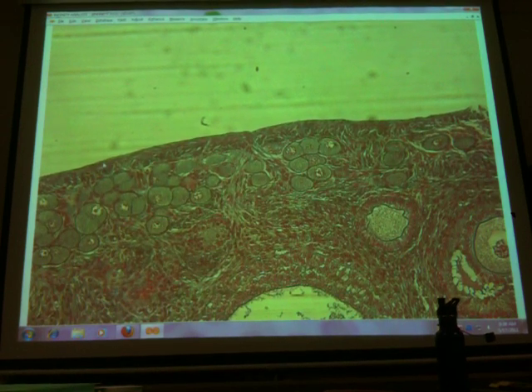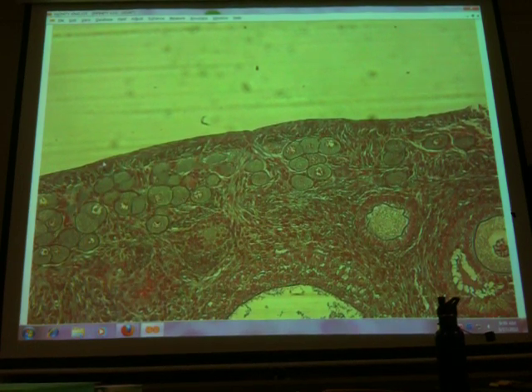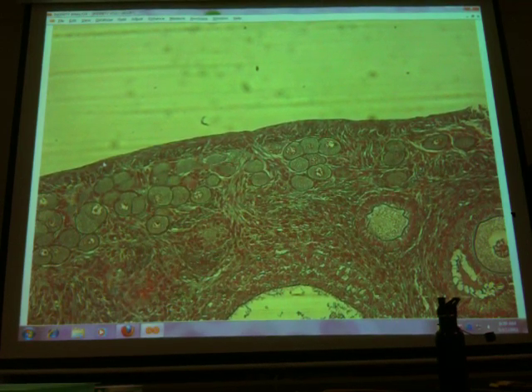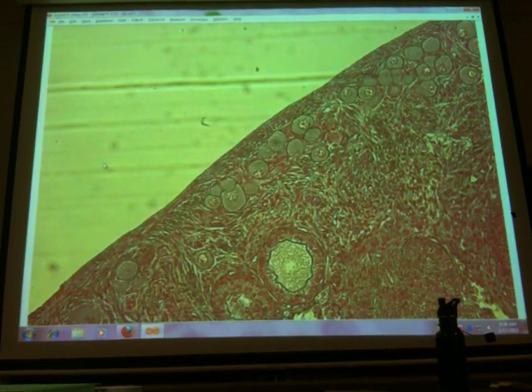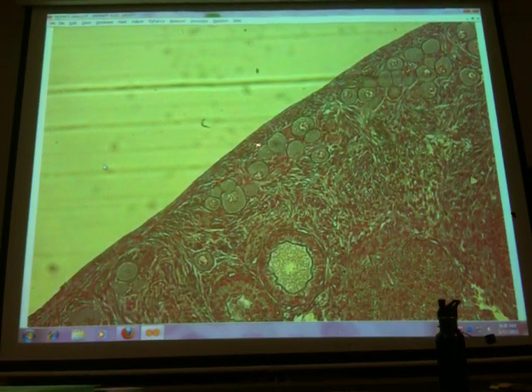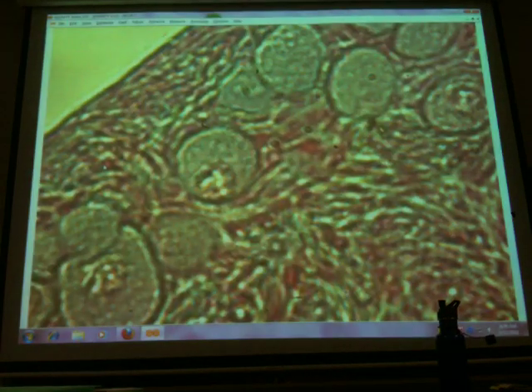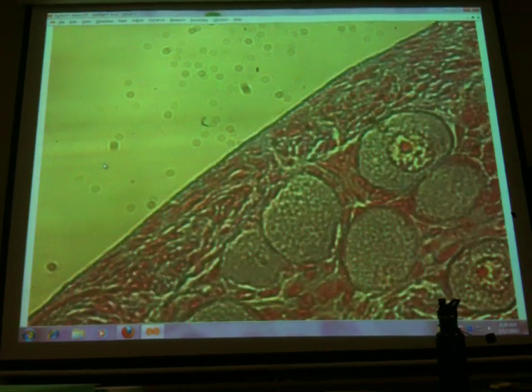Okay? Now, the tunica albuginea does surround the ovary as a fibrous capsule. It doesn't stain or appear different here, so it's a little bit challenging for me to suggest that you even really recognize it, but it's actually a pretty clear layer. It's just, color-wise, it's no different. So this outer thickness is tunica albuginea, and then at the very surface is a germinal epithelium layer of cuboidal cells. And on this particular slide, we're not picking that up.